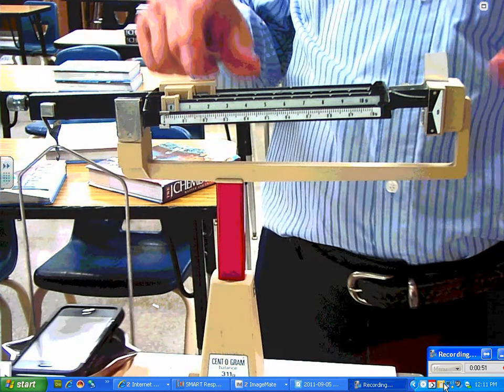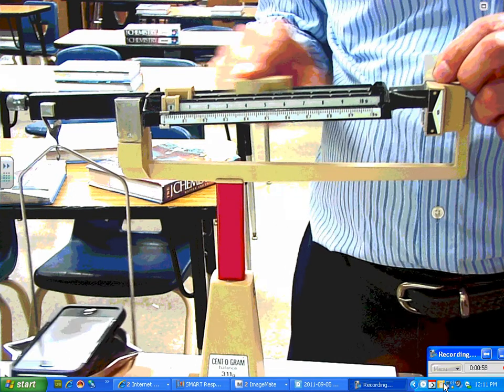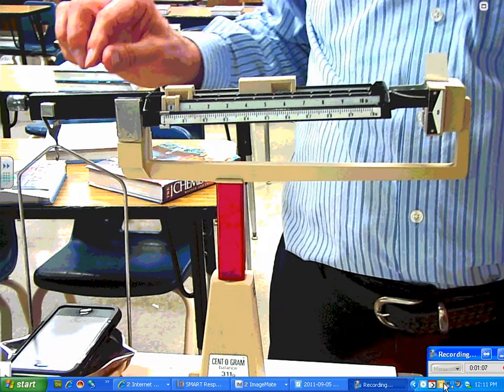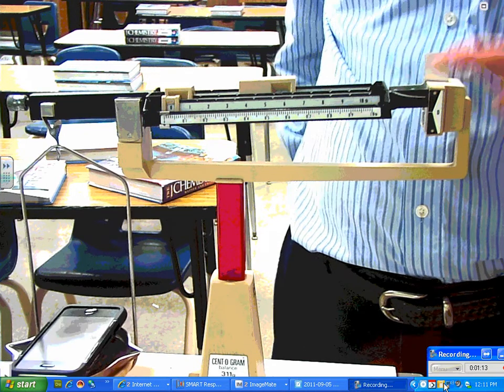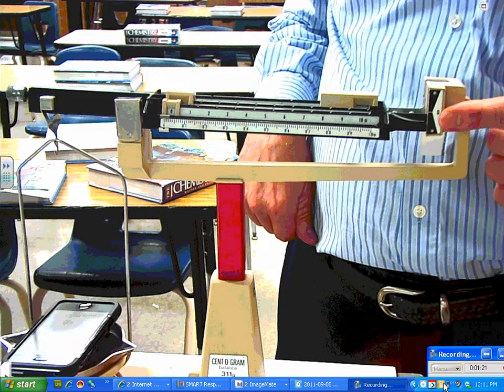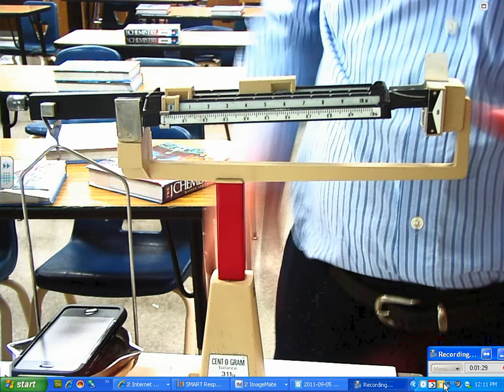I always start with my largest weight, which represents 100 grams at each notch. Listen carefully — the slider has to click in. I go to 100, and I can see the balance is still high, so I go to 200. That takes it down below the center line — the zero line. Then I go back and put it on 100.